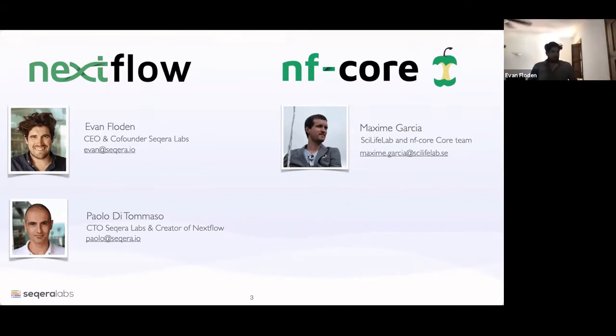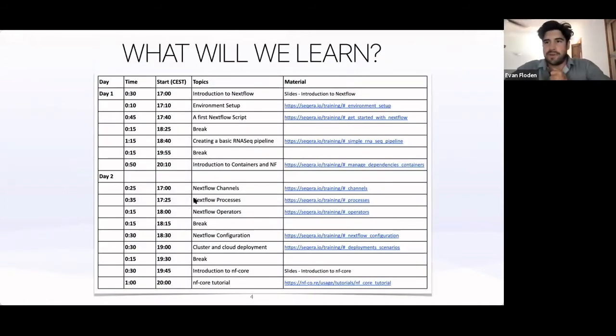Okay. So what are we going to go through? I'm going to share with you now this schedule that we have and what we're going to go through. We're going to start with just an intro, basically this part here on some slides. We're going to look at an introduction to Nextflow, the core components of it, so what makes it up. And then we're going to jump straight in and set up our environment.